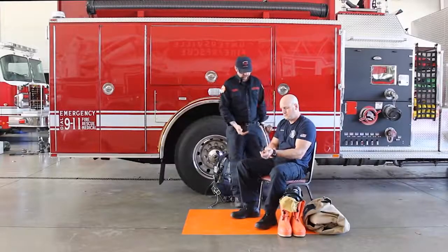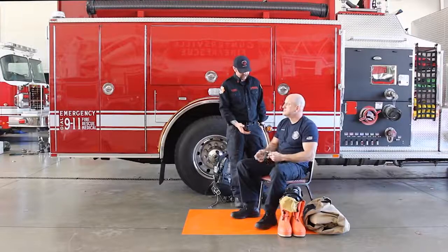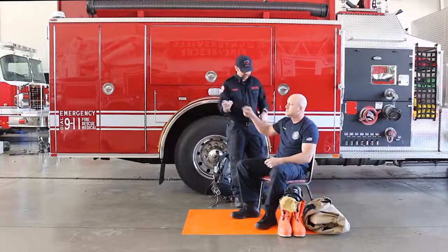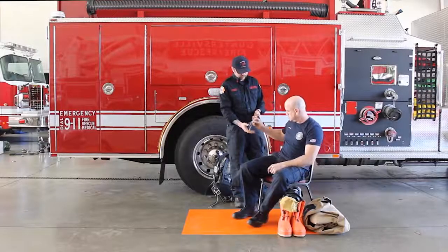An assistant should help the wearer don the garment. Remove all jewelry and personal items — pens, keyrings, badges — that might damage the garment.